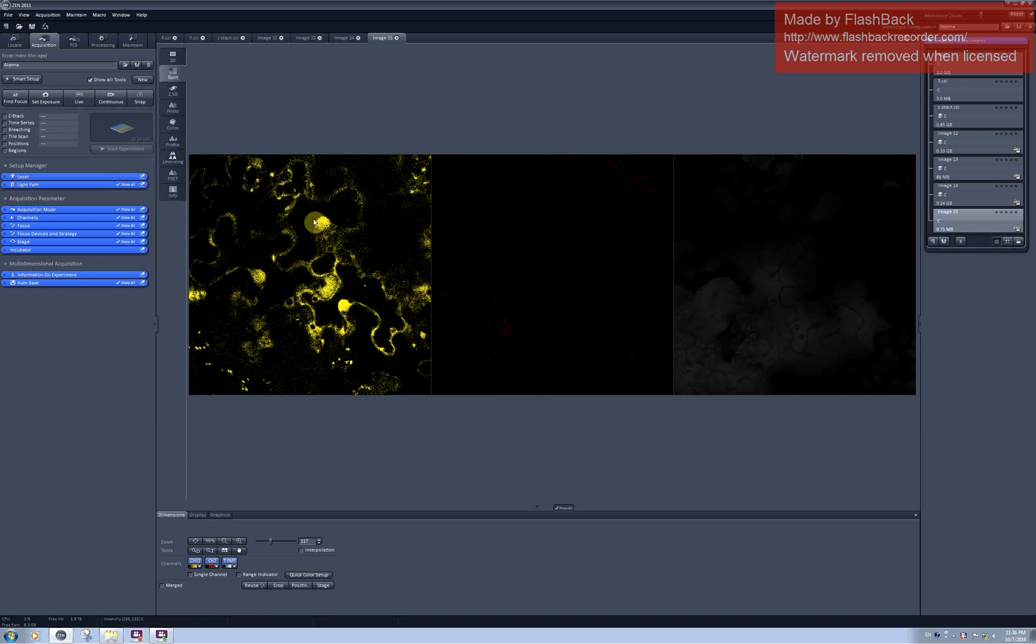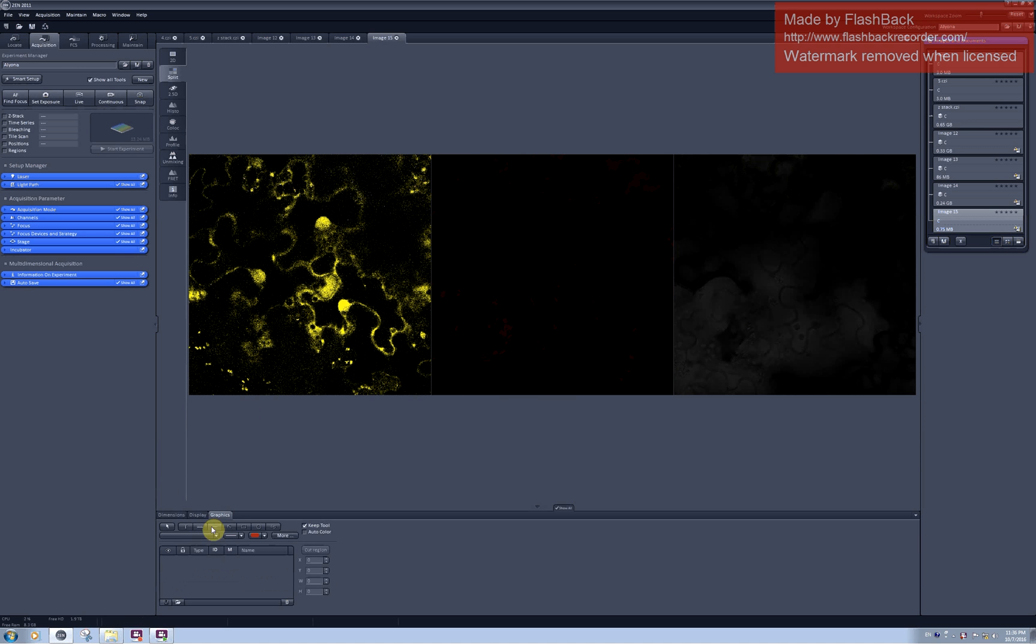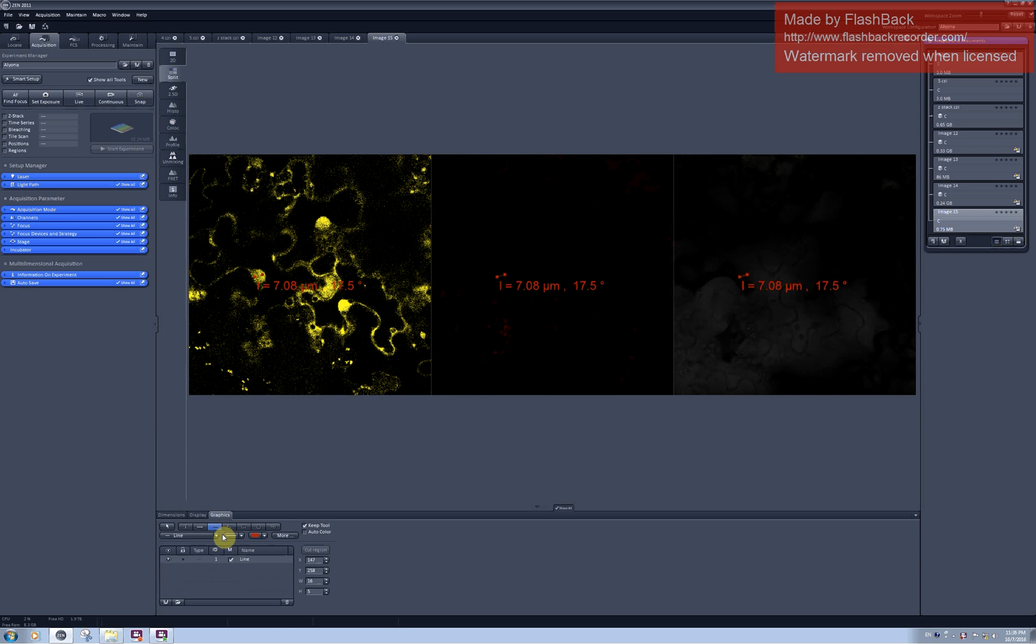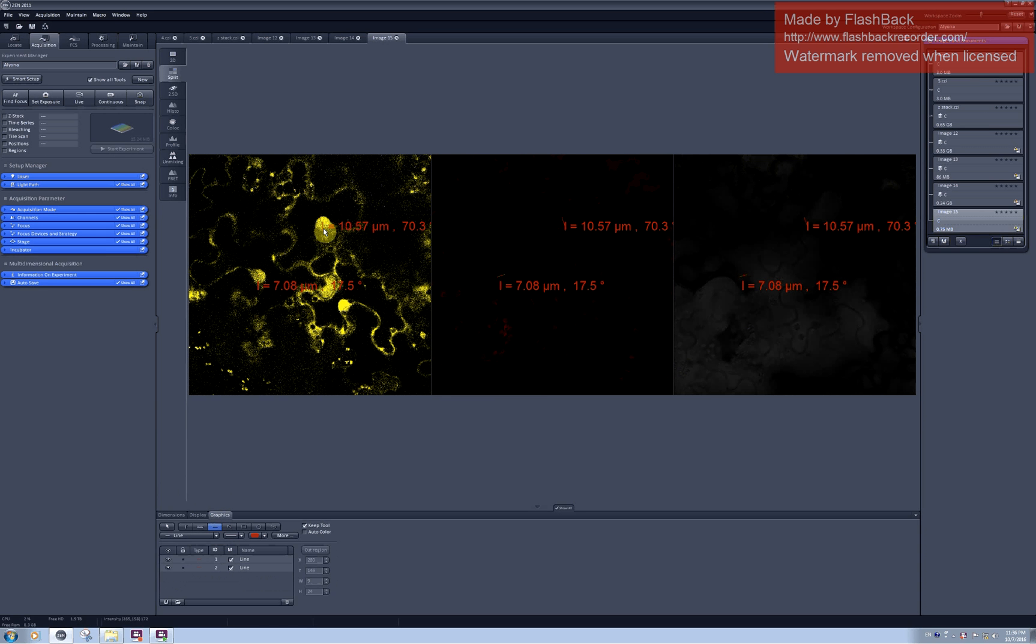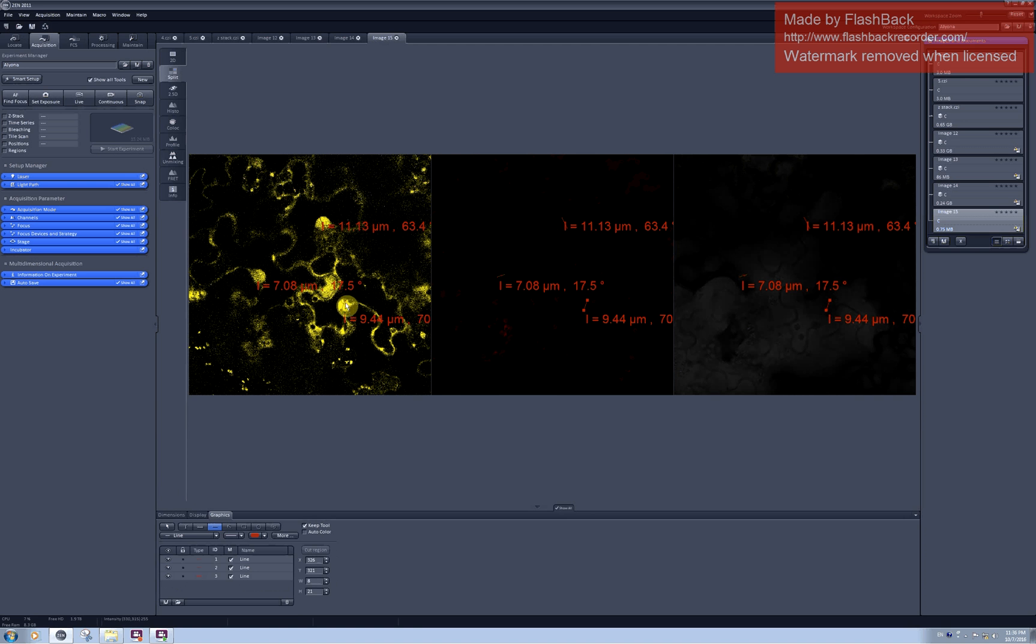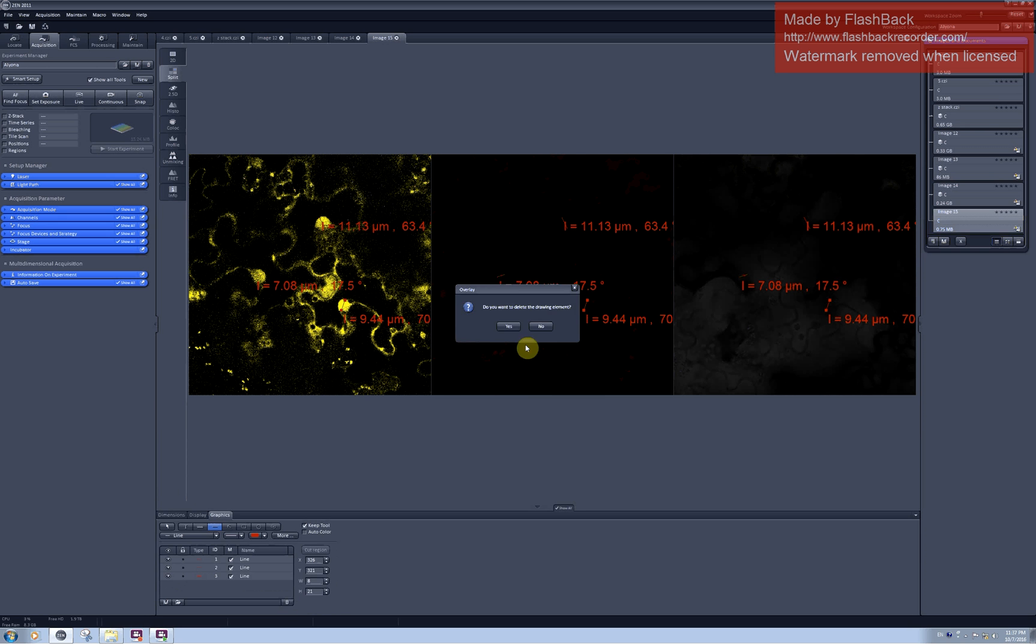In my experiment I would like to see what happens in the whole nucleus. So I can measure what is the diameter of the nuclei in my sample. And this one is 7 micrometers, this is about 11, this is about 10. So I have approximately 10-12 micrometer nuclei.